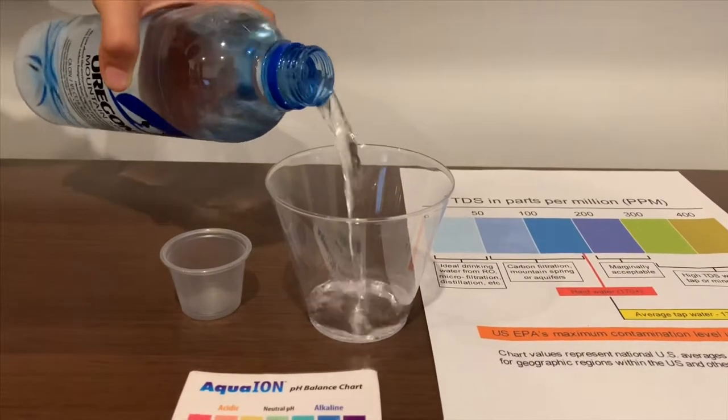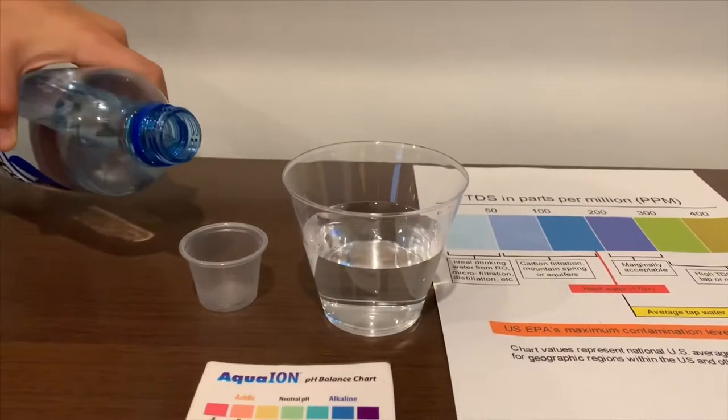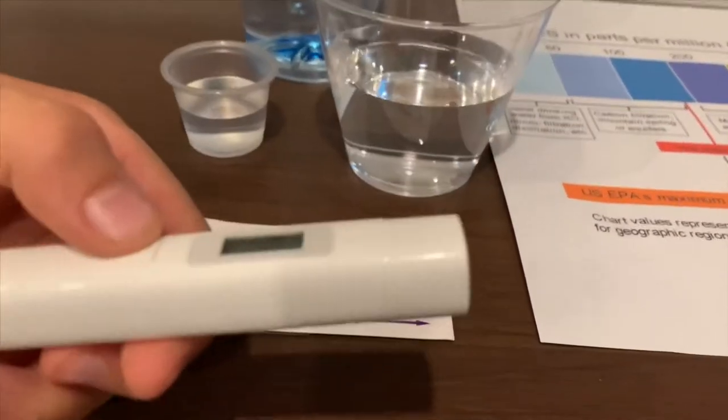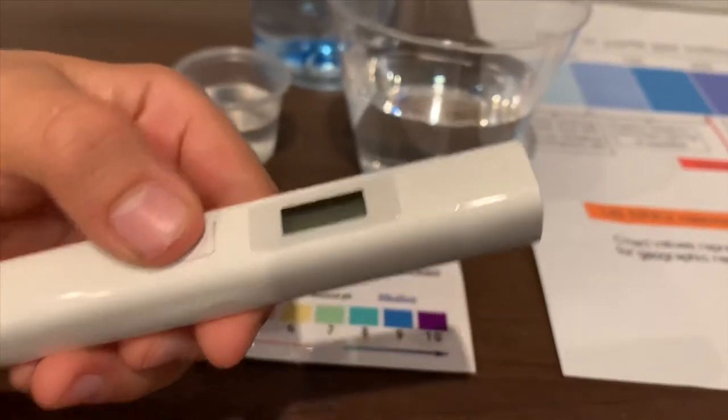Let's pour some water in. First, we're going to test the TDS level. If you want to buy this TDS tester, check the link down below.